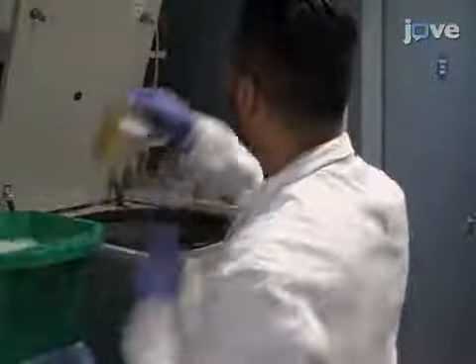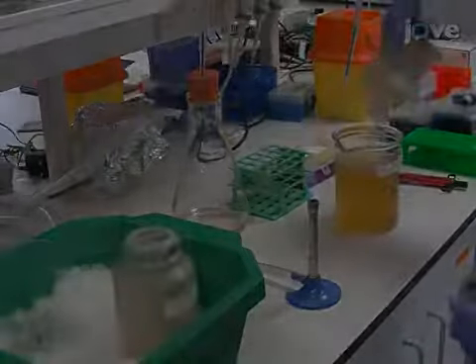Spin down the bottles at 4500 times G and 4 degrees Celsius for 25 minutes. Then discard the supernatant and store the bottles on ice.